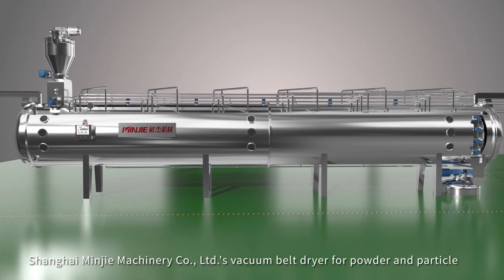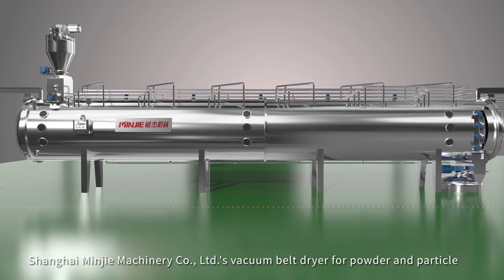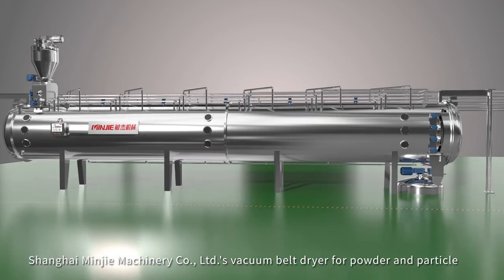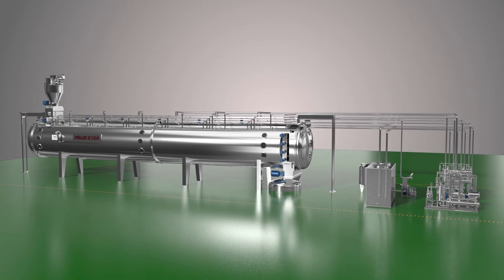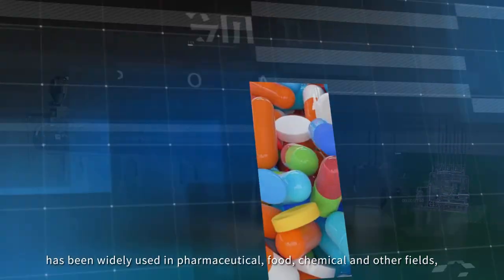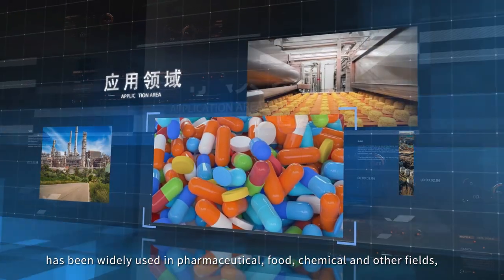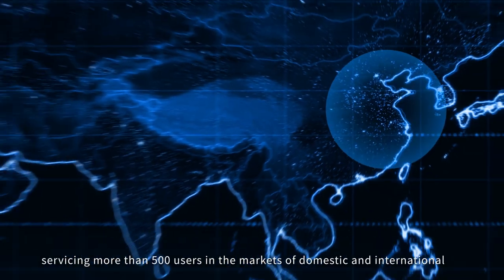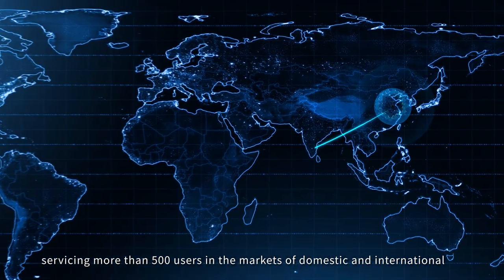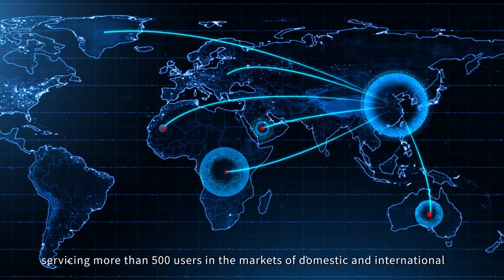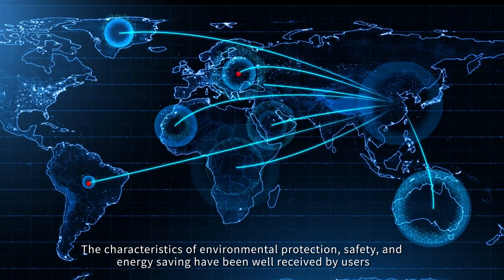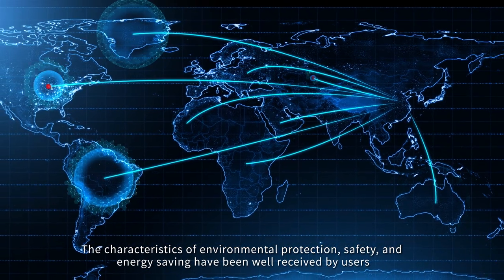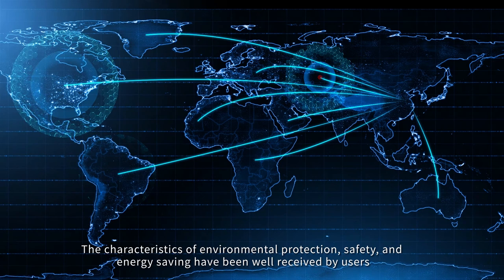Shanghai Minji Machinery Co., Limited's vacuum belt dryer for powder and particle has been widely used in pharmaceutical, food, chemical, and other fields, servicing more than 500 users in the markets of domestic and international. The characteristics of environmental protection, safety, and energy saving have been well received by users.